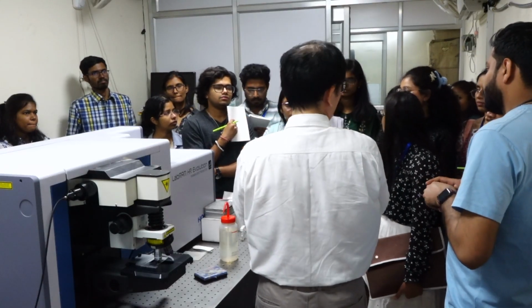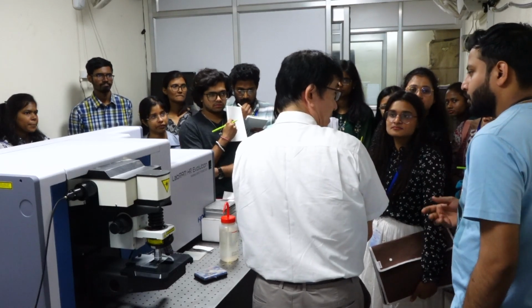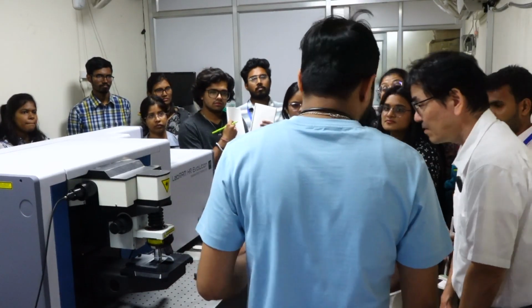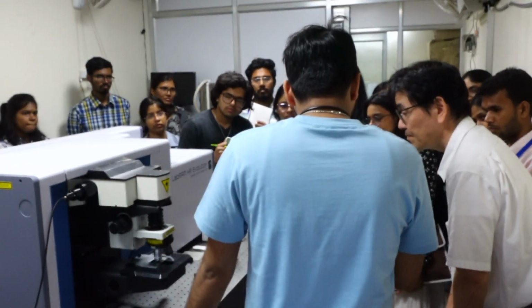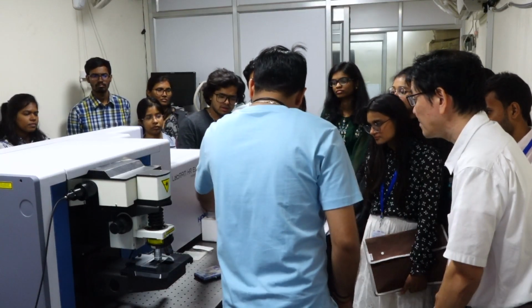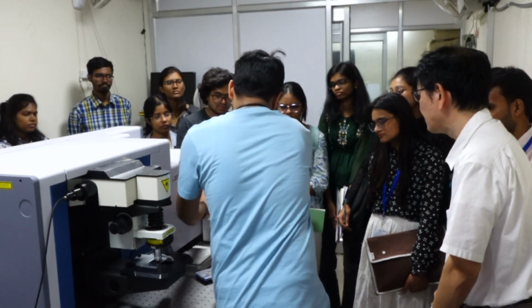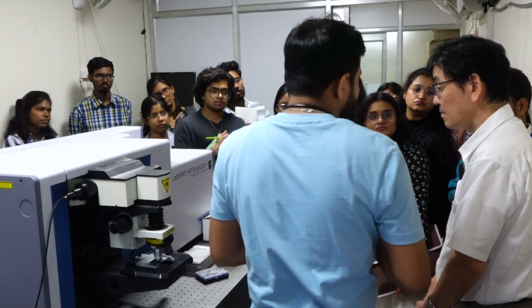Any other question? No? Shall we move to measurement? Here we can do liquid samples. There are two types of instrument. We can just drop the sample on the slide and take the measurement, or we can take the sample in a cuvette and put the cuvette here. Which one will be better?